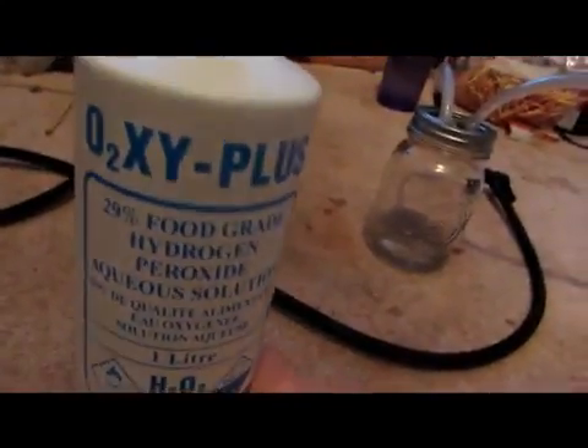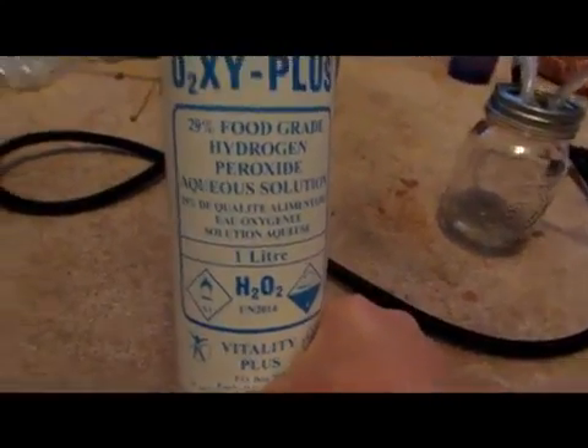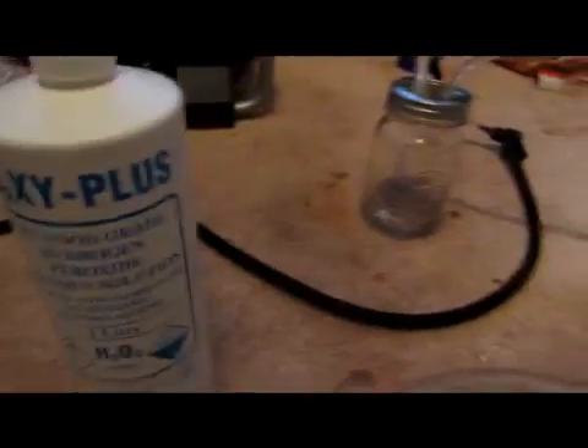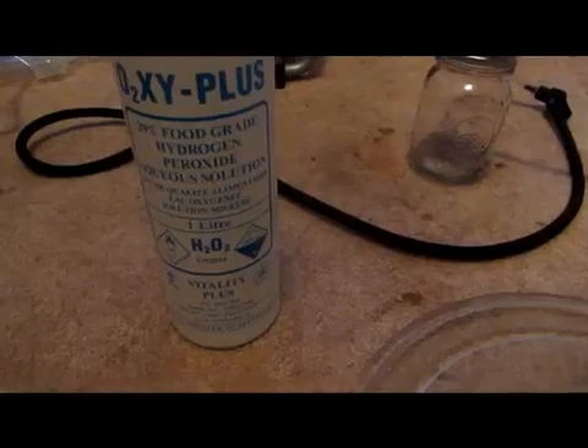This is 29% food grade. Some people actually eat this, and apparently it kills bad bugs in your gut or something. We're not going to be using it for that, but that's 29%. Anything around that percentage should work fine.